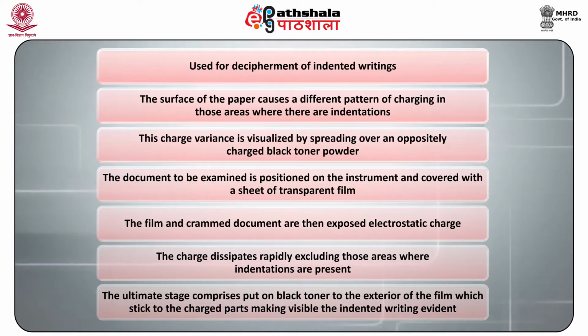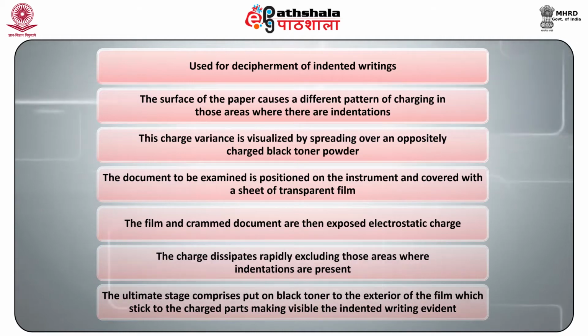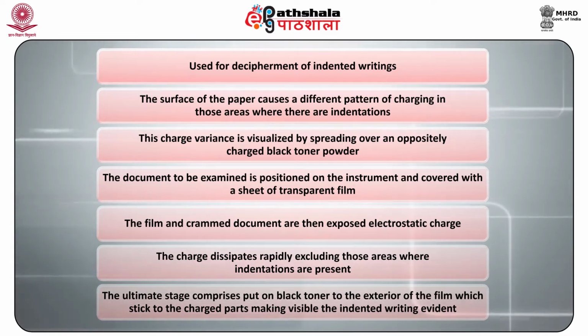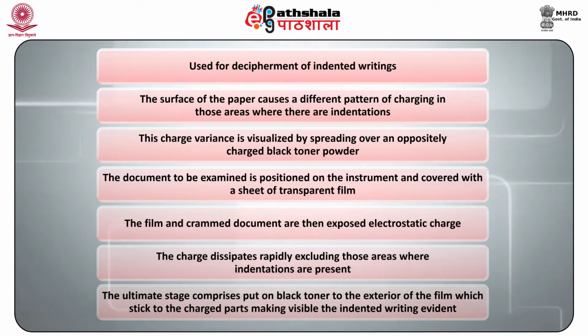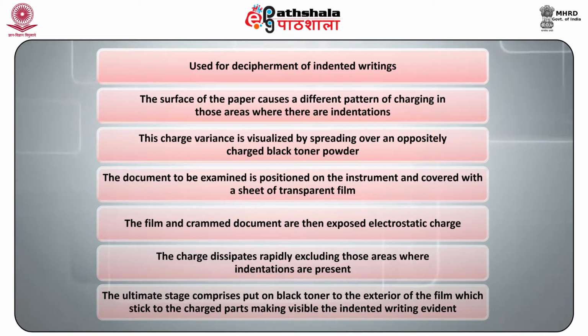The film and clamped document are then exposed to electrostatic charge. The charge dissipates rapidly, excluding those areas where indentations are present. The ultimate stage comprises putting black toner on the exterior of the film, which sticks to the charged parts, making the indented writing visible.